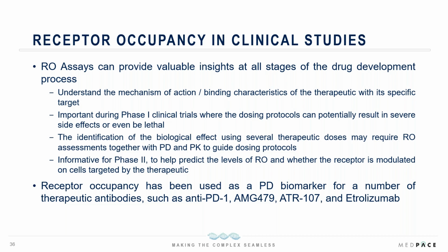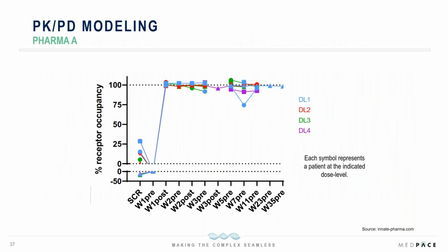And at Medpace, we have seen an upswing in the receptor occupancy assays that we've been awarded in the last 2 years. 2 of these have made it to phase 2. So next I'm going to talk a little bit about how you can utilize receptor occupancy assays.